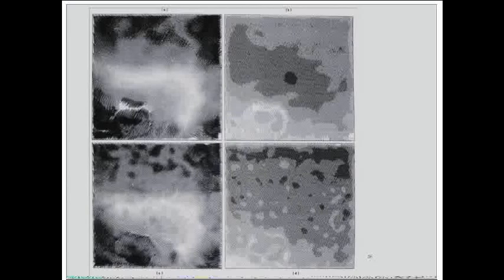And in the first stage, you treat it just like it was an untilted crystal. And by definition, normally, because you've taken the reference patch from the middle of the crystal, you get best correlation between the reference patch and itself in the middle of the image. And you can see you get a kind of narrowish band of good correlations.